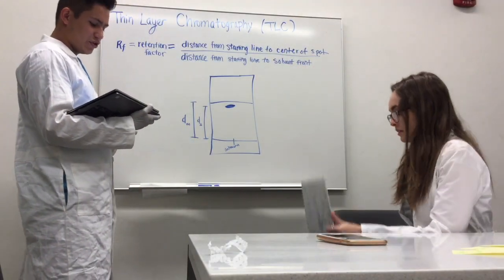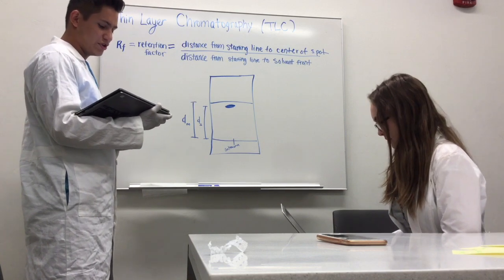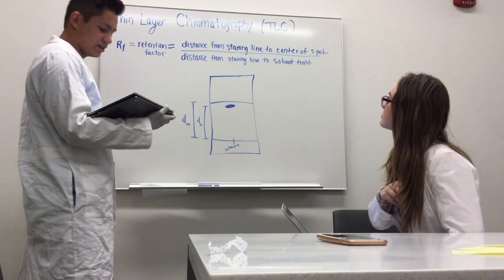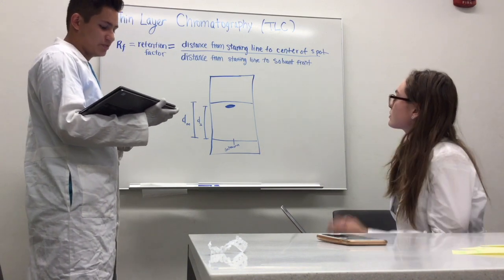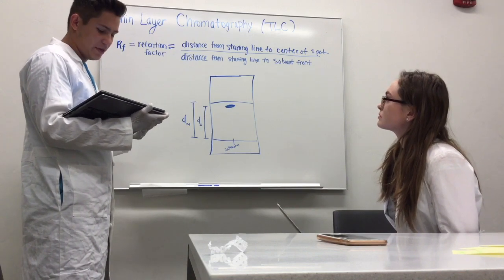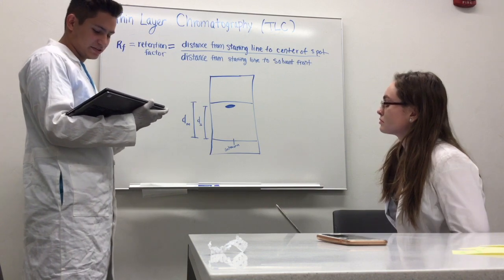Since you're new here, I'm going to show you how we identify substances such as this. Now, a witness did tip us off, and we know that the poison was a mixture, and the compounds in the mixture only contain carbon, hydrogen, and oxygen. There are 6 more experiments we can conduct to determine the rest of the information we need: thin layer chromatography, absorbance spectroscopy, gas chromatography, infrared spectroscopy, mass spectrometry, and nuclear magnetic resonance.